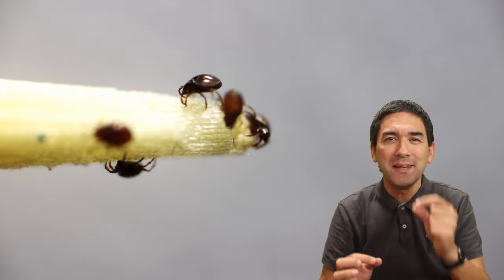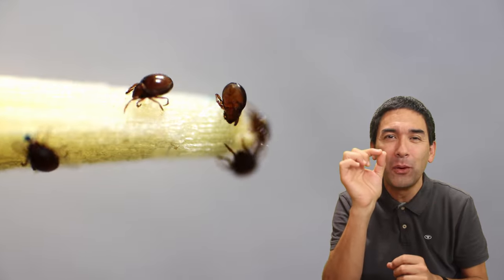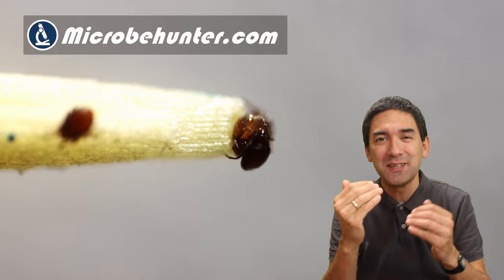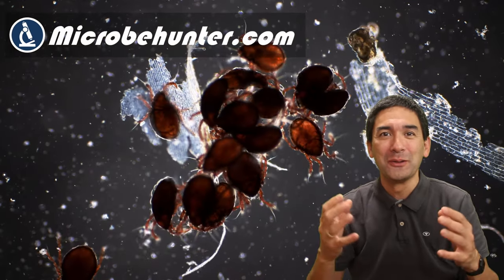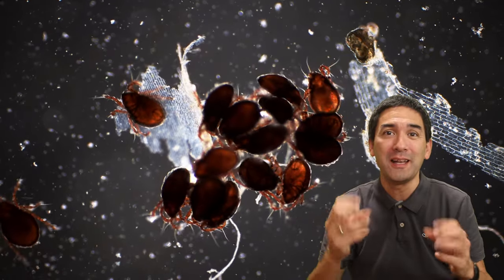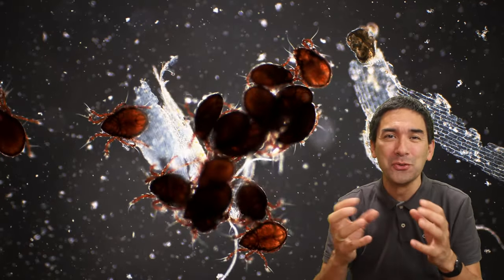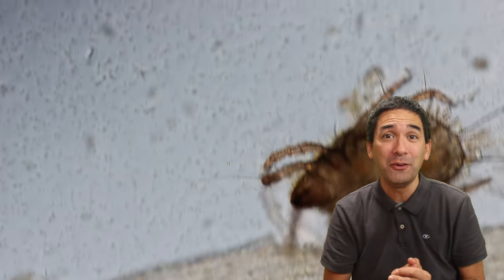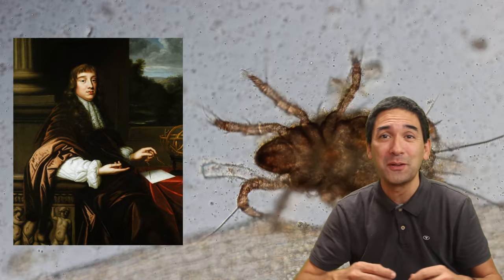These here are tiny mites which I found in a water sample, and I put them on a tip of a toothpick so you can see the size comparison. Hello and welcome, Microbe Hunter here. Not only on a tip of a toothpick, but they also like to cling to each other in a water sample and also to decompose in plant material. There are many different mites that I found, and I'm not of course the first one to observe them under the microscope.